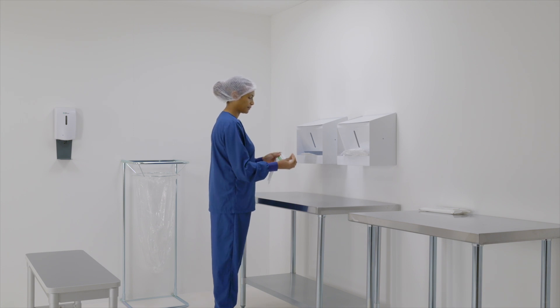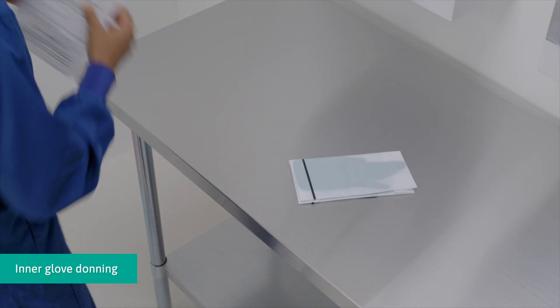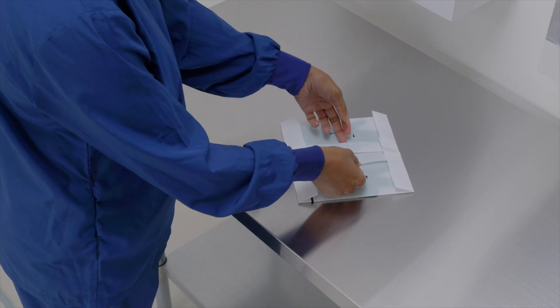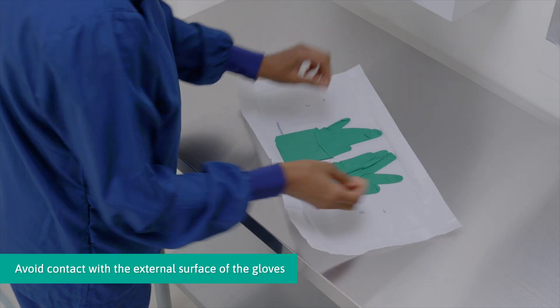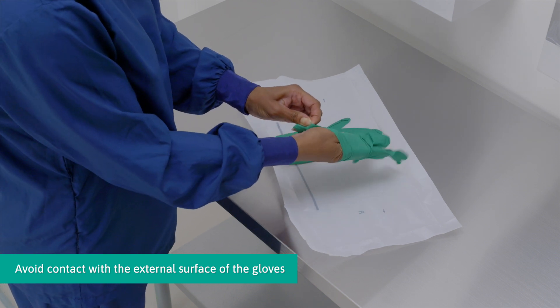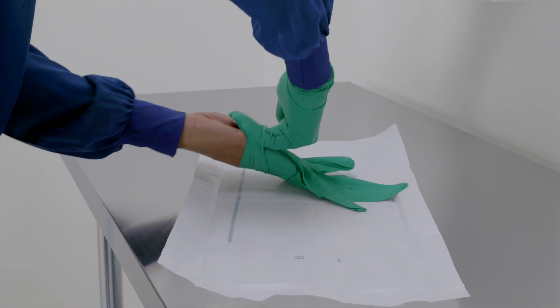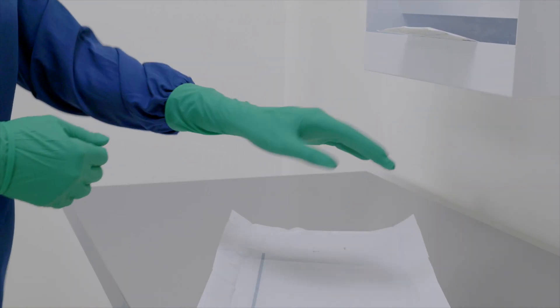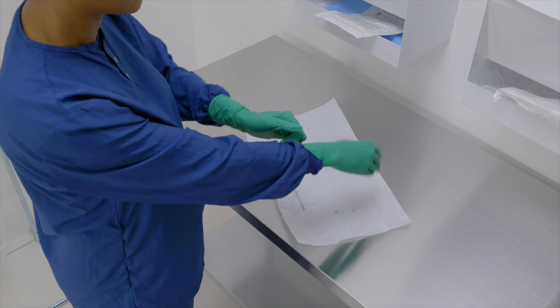Carefully retrieve the contents from the packaging. Open the inner wrap using the flaps; once opened, press down on the corners of the inner wrap to keep it open wide. Grip firmly at the folded cuff and slide the other hand into the glove. Pull the folded cuff towards the wrist. Slip the fingers of the gloved hand into the folded pocket of the folded cuff, slide the other hand into the glove, and unfold the cuff over the sleeve. Unfold the cuff until it overlaps the sleeve.